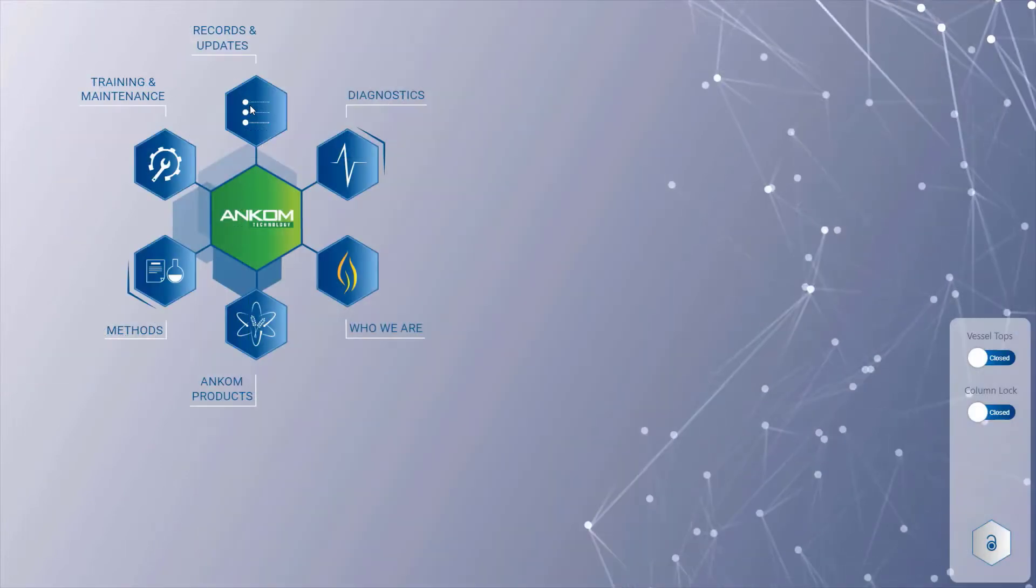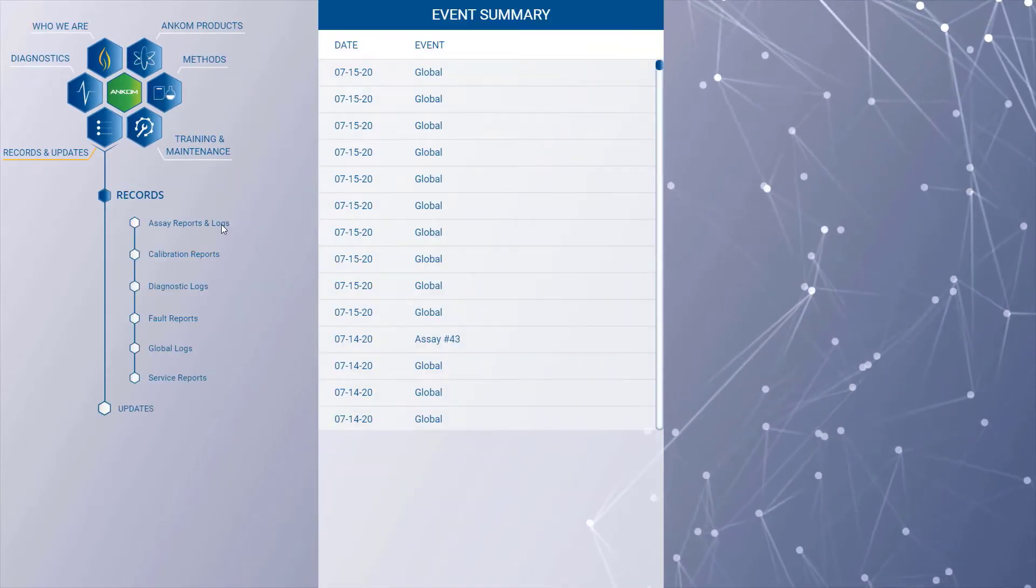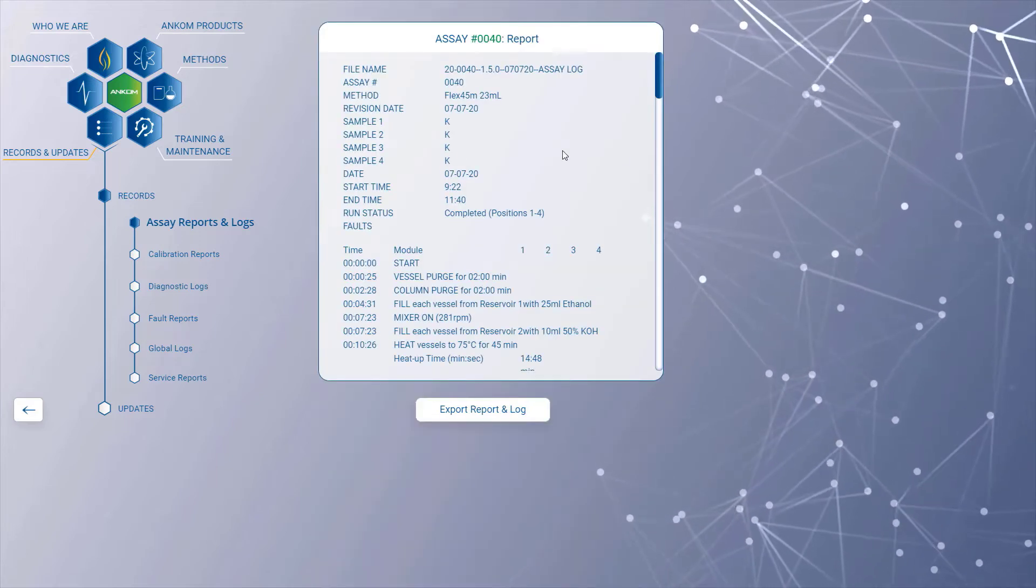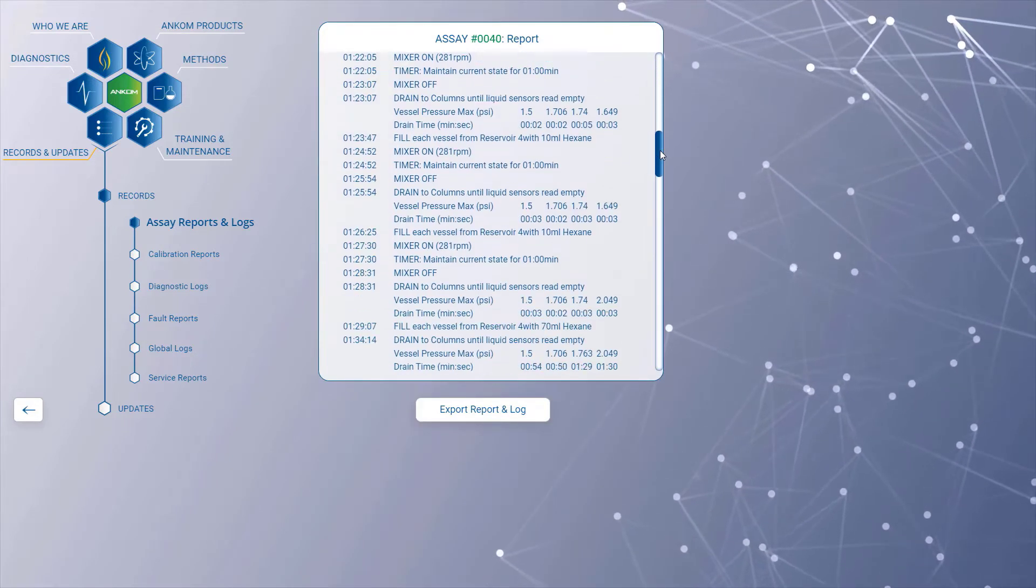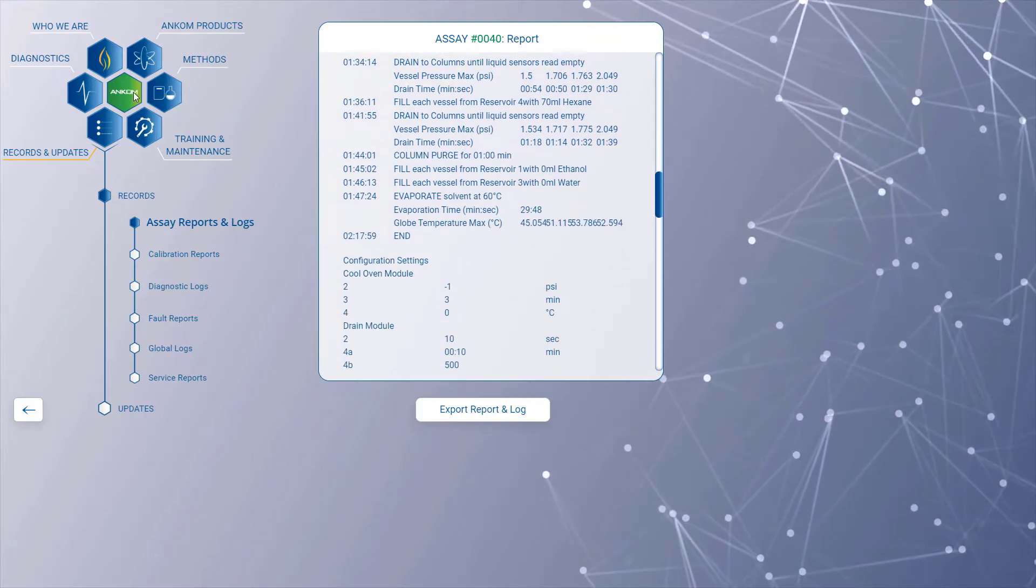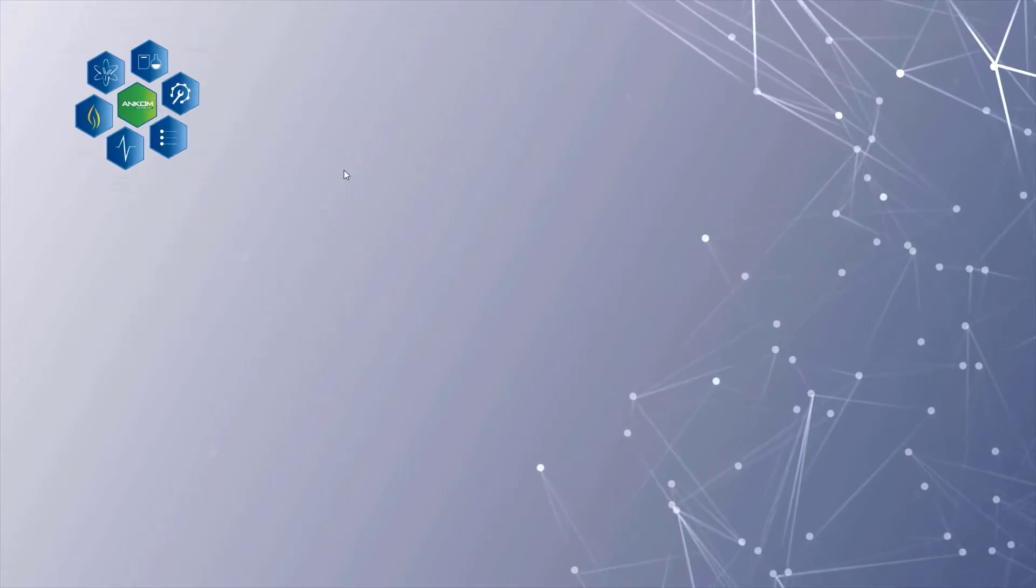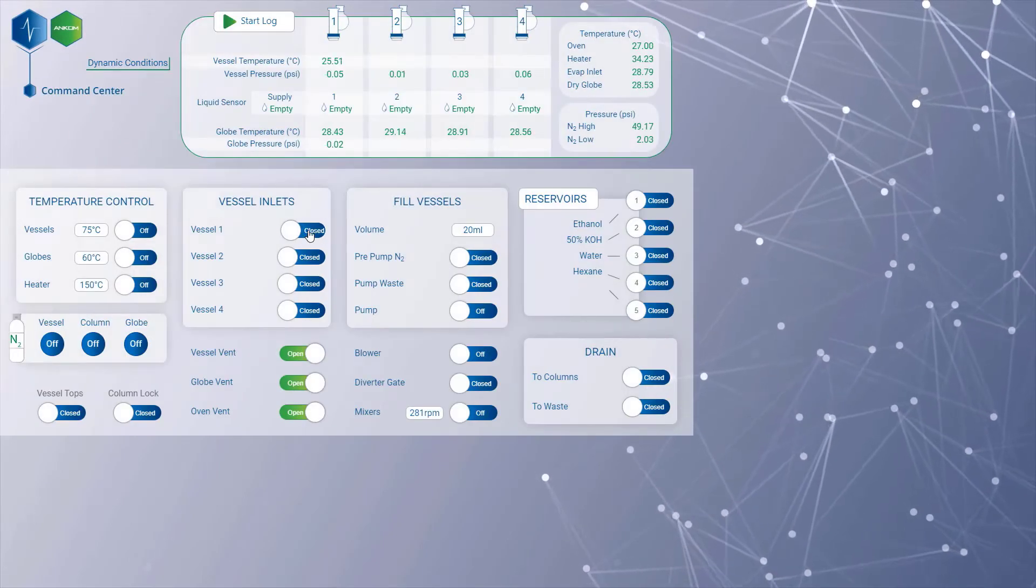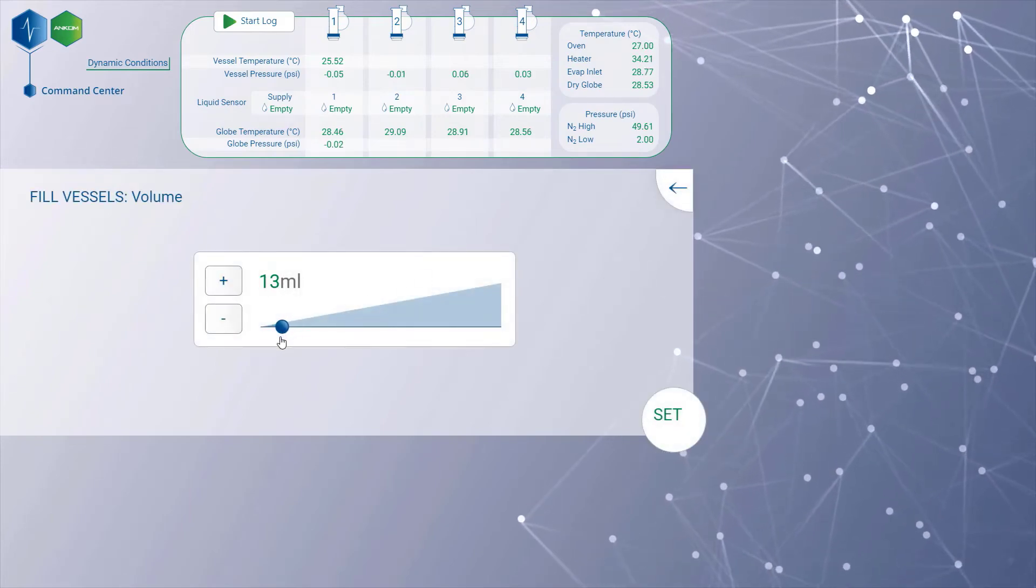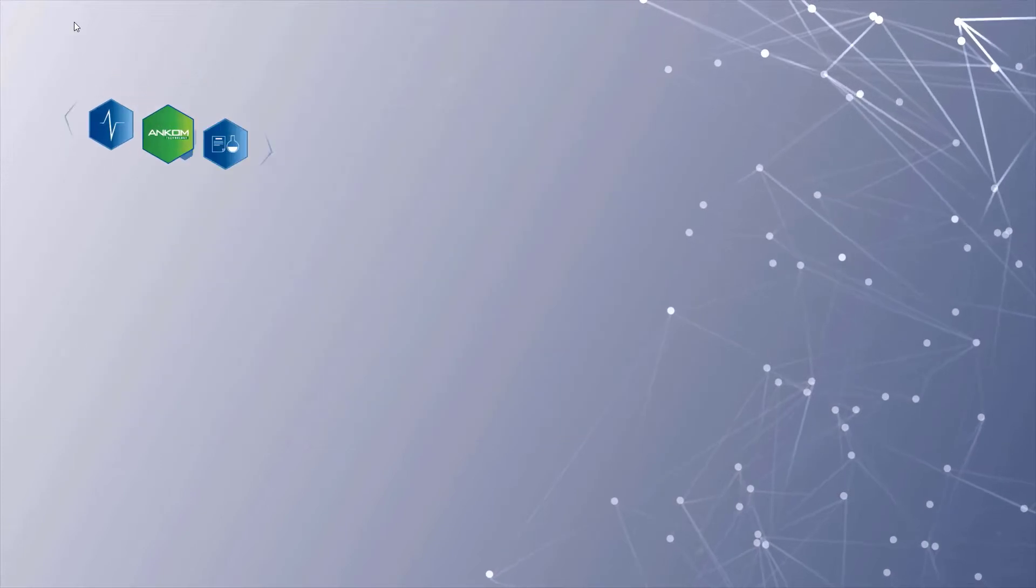The ANCOM Flex Analyte Extractor's software includes complete record keeping of all assays, faults, calibrations, and services. Short reports and raw data files can be downloaded for record keeping or further diagnostics. The advanced diagnostic center allows the user to run diagnostic tests on the instrument to support troubleshooting and calibration. Once the user is ready, they can start the assay and walk away.